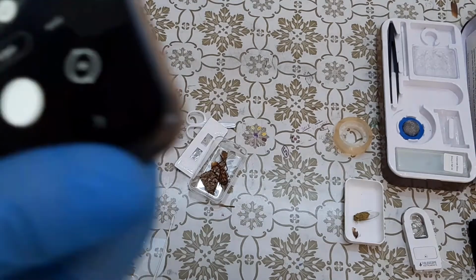Yeah. So now let's see how it looks like under. So basically between the canals there is that transparent layer, so that's why the light is looking so powerful, and we are not able to see in details.